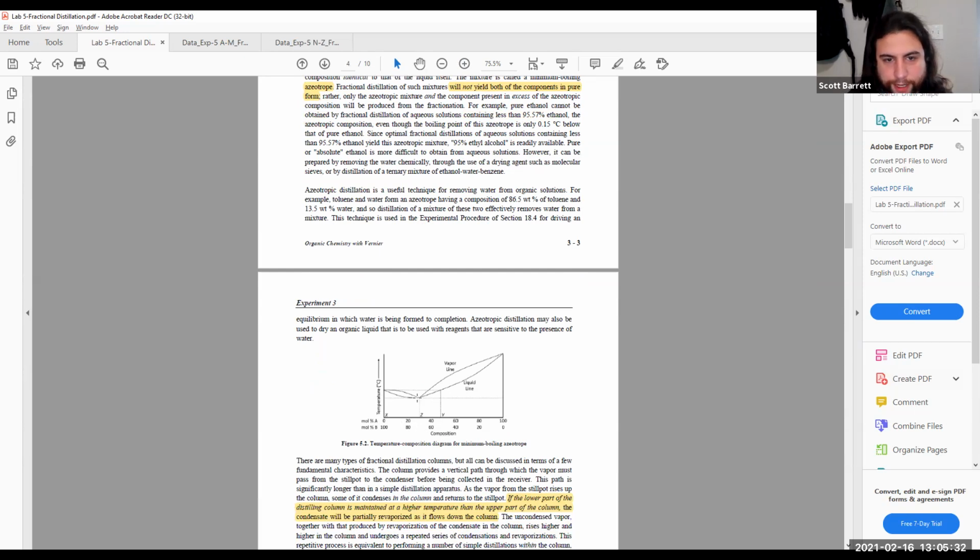So here, at a given temperature, if you're given a molar ratio of, let's just say, about 30% mole A and about 70% mole B, then at point Z, unfortunately, if you decide to boil it at that 30 to 70%, it's an azeotrope at that point, meaning that both will boil equivalently. So at no point can you actually separate the two if you have the 30 to 70%.